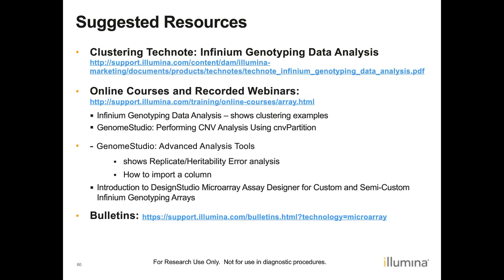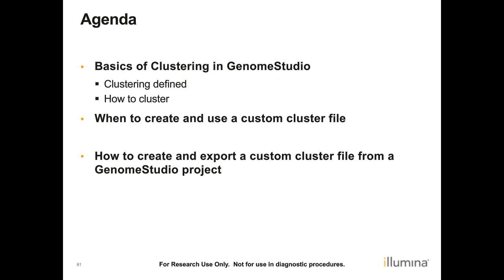And I just wanted to remind you all of the agenda that we started with. We wanted to look at the basics of clustering in GenomeStudio, define what clustering is and how to do it in GenomeStudio. And also we wanted to talk about when to create and use a custom cluster file and how to create the custom cluster file from GenomeStudio.